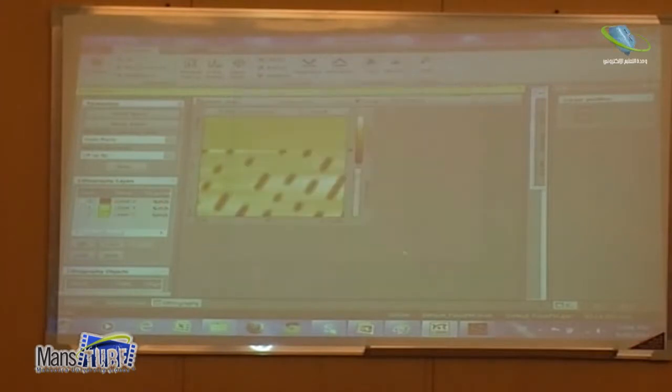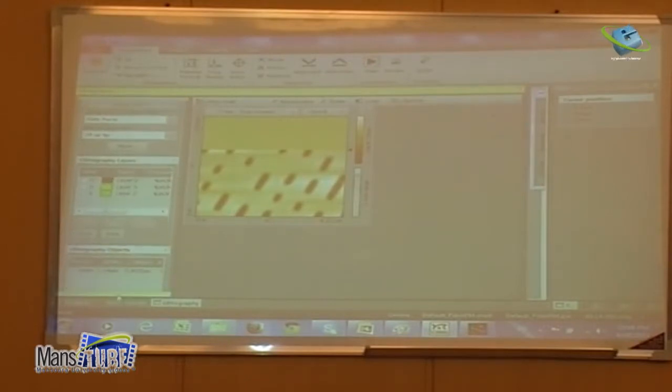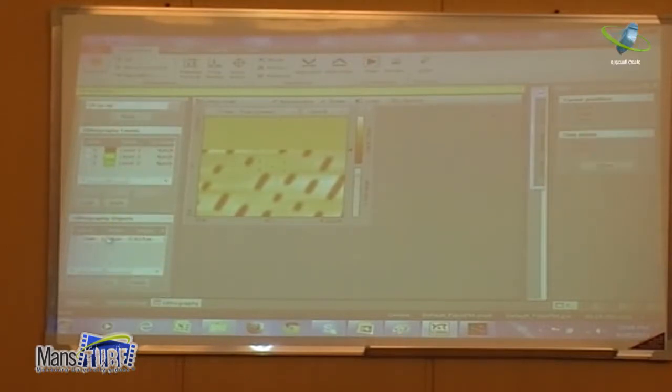Okay, and where is it on the image? Is it here? So this is layer 2. And now what I will do, I will shoot it from object. This is the image. Then I can take it here and move it to here. Okay. Then I go here.